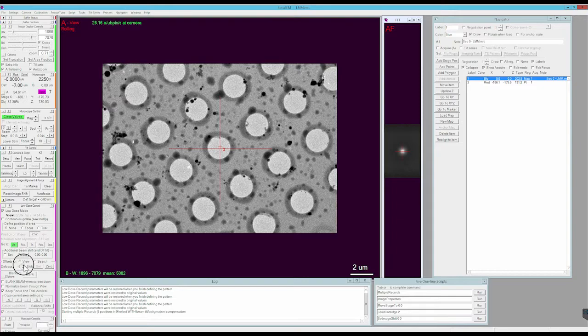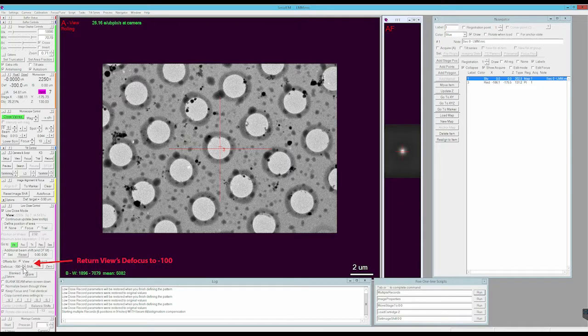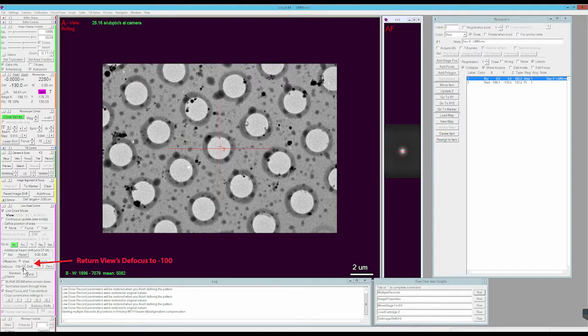Last thing you need to do is reset the defocus value for view back to minus 100 microns.